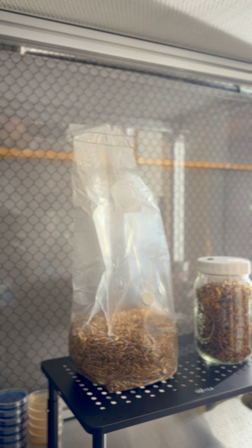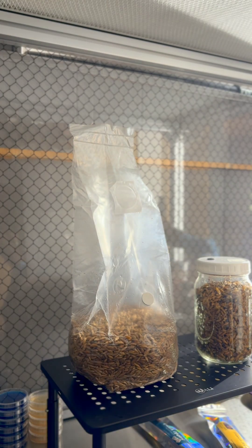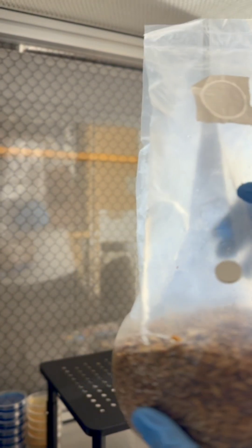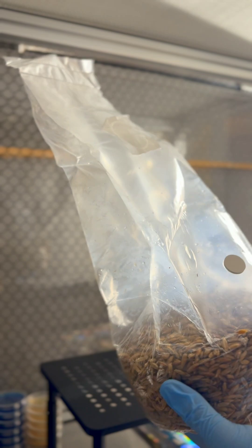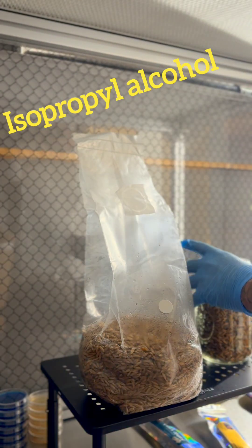We start with pink oyster liquid culture. We're under the flow hood. What I like about the flow hood is you can work and not have to worry about the environment not being sterile. If you have a grain bag with an injection port, you don't necessarily need a flow hood or an SAB — you can do it in any area, just spray it down.